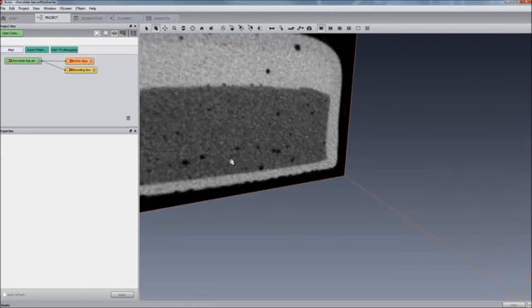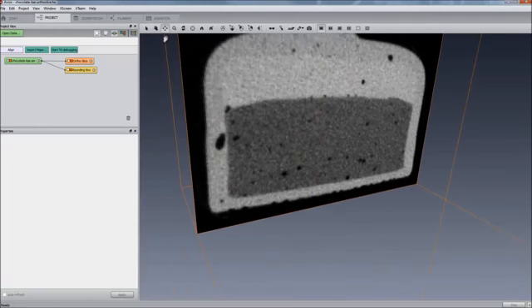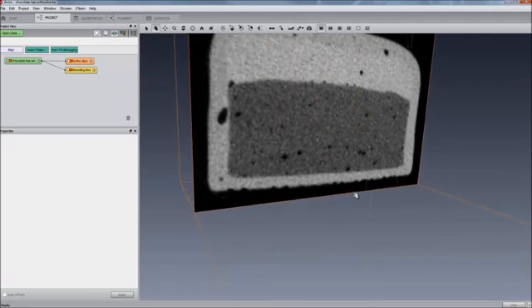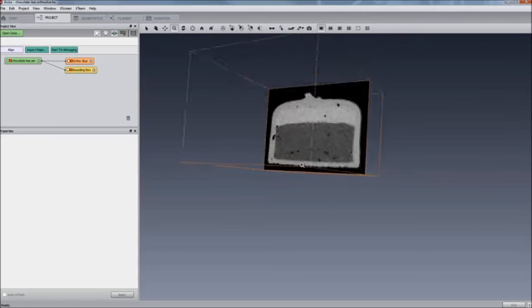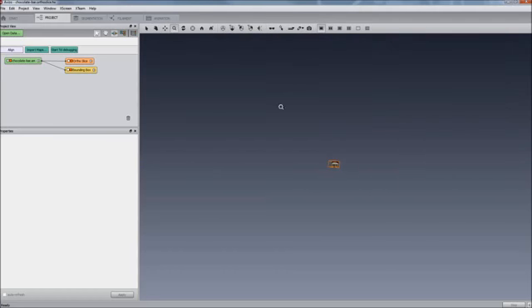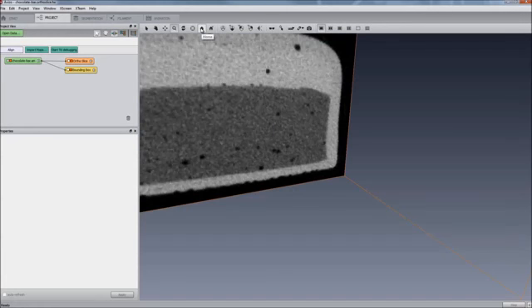The next 2 buttons work together. One saves the camera point of view, while the other restores it. For example, we can save this camera position by clicking on the Set Home button. Then, after having rotated, moved, and zoomed out the camera, we can go back to the previous point of view just by clicking the Home button.